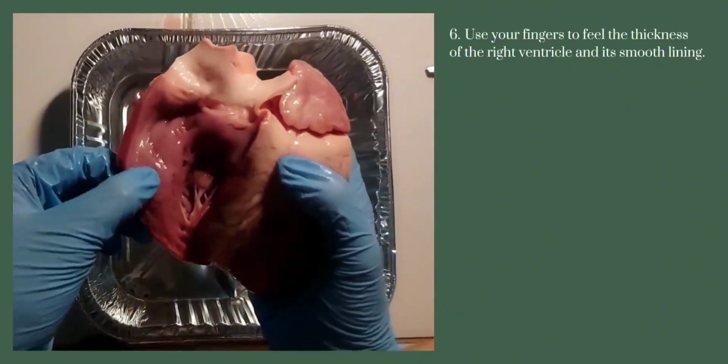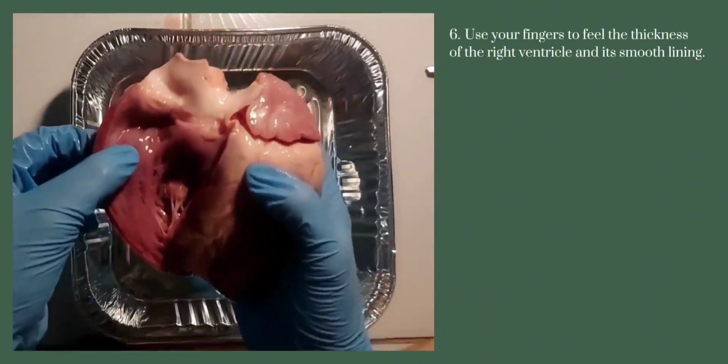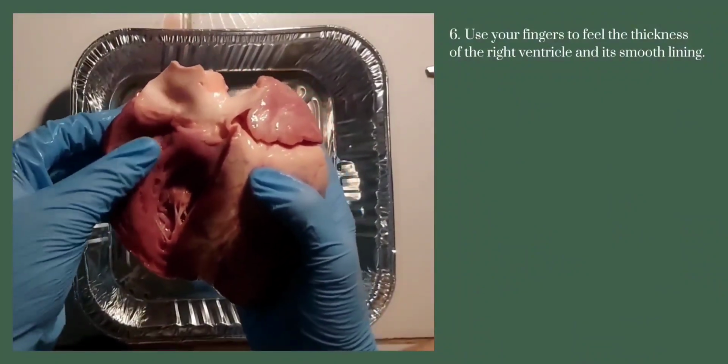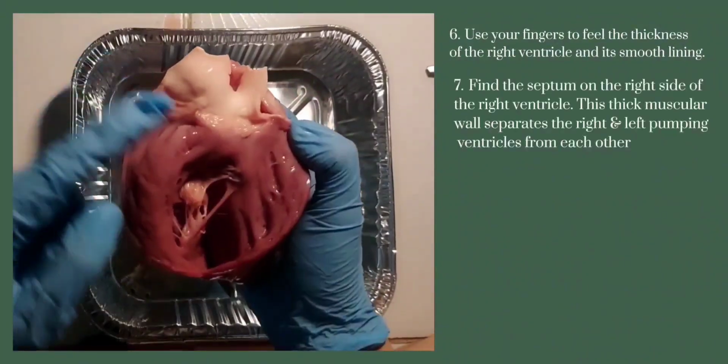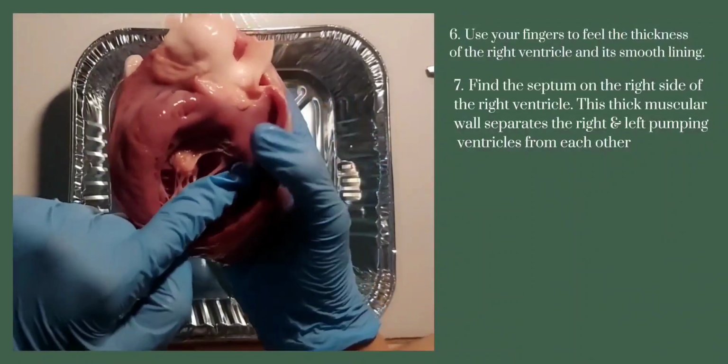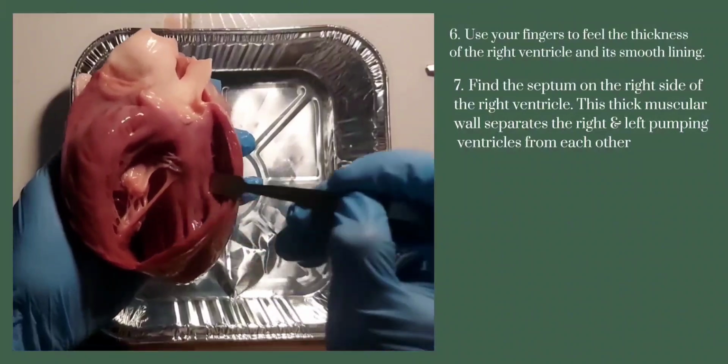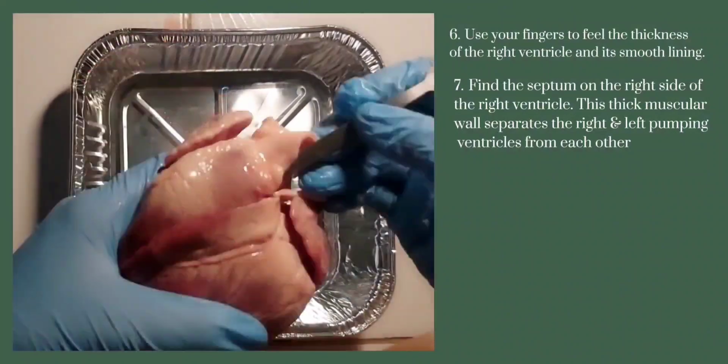Use your fingers to feel the thickness of the right ventricle and its smooth lining. Also note the network of irregular muscular cords on the inner wall of this chamber. Find the septum on the right side of the right ventricle. This thick muscular wall separates the right and left pumping ventricles from each other.